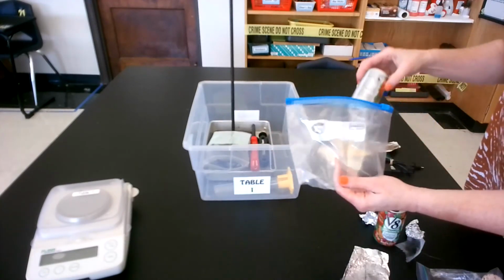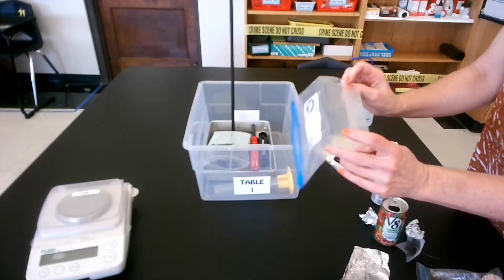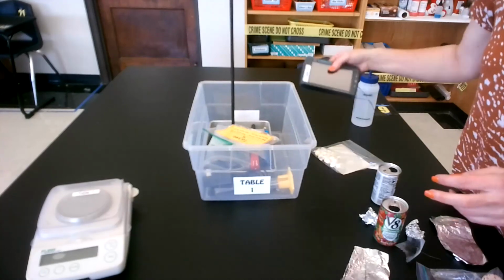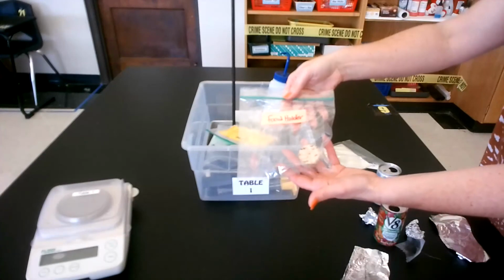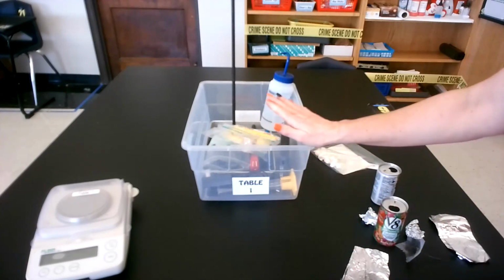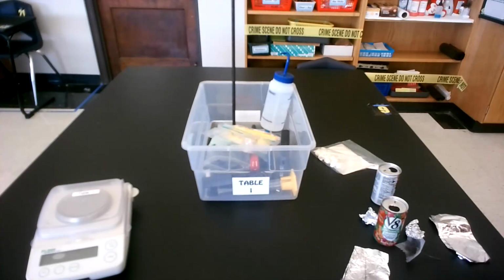I've got more. And again, you'll need to restock this if you're one of the classes that is asked to restock. The last class, you do not need to worry about it, so just put that in there. The food will go back in. The charger, the Quest if it's off, my wash bottle, and then I restocked the food holder bag, or put just the cork in. Make sure the electronic balance is completely turned off. You'll put the tubs back at the table, and then the electronic balances will be put on either the cart or at Blake's desk. I've got the ruler. Then you'll spray your table down.